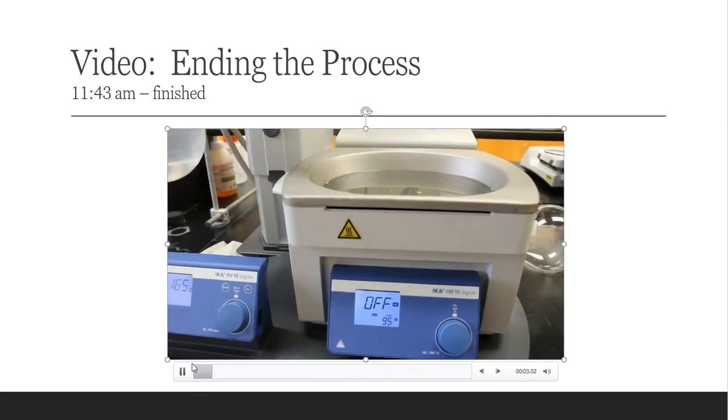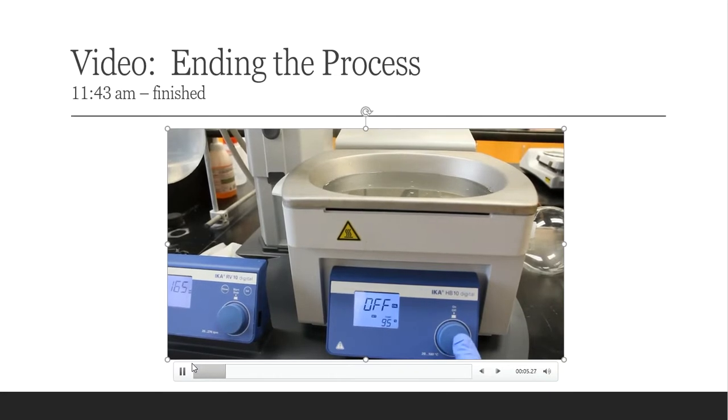Okay, so my process is finished. The only thing I did was push this button one more time, of course, to turn it off. And that's what you're seeing here. It says off, but keep in mind, it's still hot.